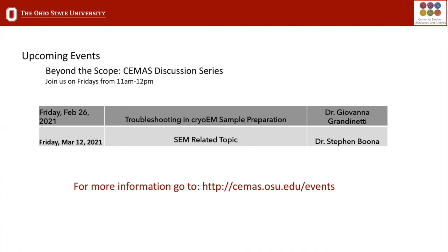Well, there certainly are a few. You might say that cryo-electron microscopy and all of the things we're also showing from that aspect are really the next frontier. Everything going on in cryo and single particle analysis and the way we're pulling out information on a smaller and smaller scale from proteins and biological materials is new.